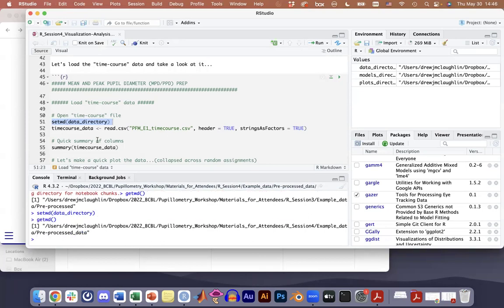Okay. If you have a hard time and you're in R Markdown, if you're not in R Markdown, you aren't going to have a hard time with this. As you can tell, I typically write in just basic R scripts, and I tried to convert it to R Markdown. And that's where some of the little hiccups come in.